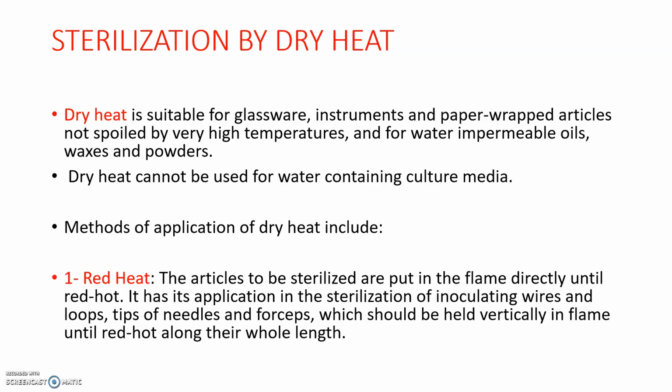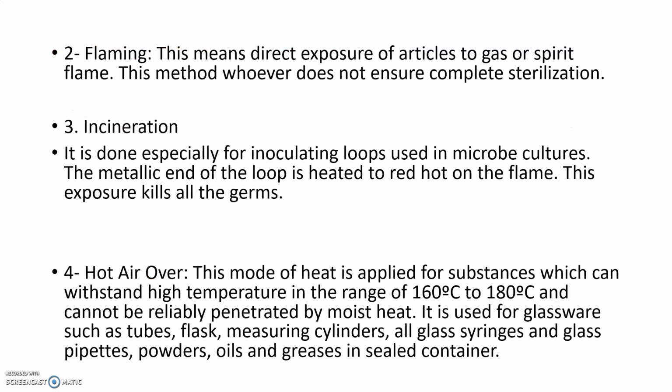In the case of red heat, the articles to be sterilized are put in the flame directly until red hot, and it has its application in the sterilization of inoculating wires and loops and tips of the needles and forceps, which should be held vertically in flame until red hot along their whole length. So this is the red heat.